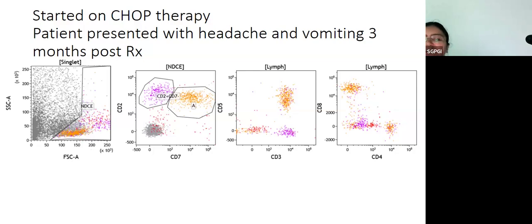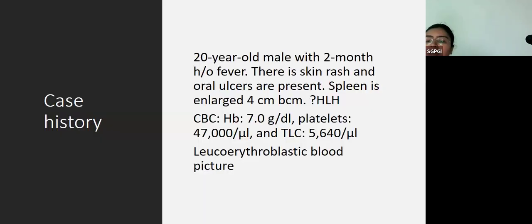Okay. So on this CSF, one more thing that I wanted to tell you was that if you look at the forward scatter versus side scatter plot and you look at the scatter of this cell, this is actually ahead. So it has a high forward scatter and has an intermediate side scatter. And this also can be a useful tool in your hands.